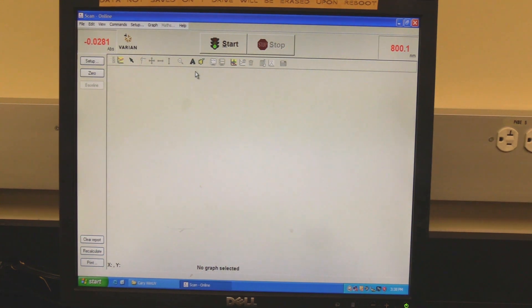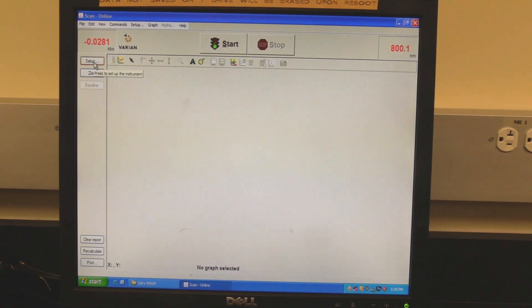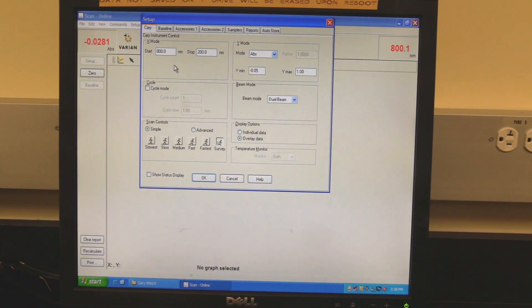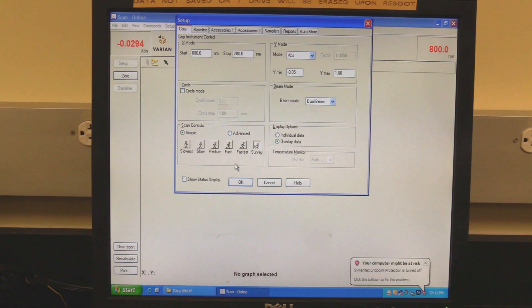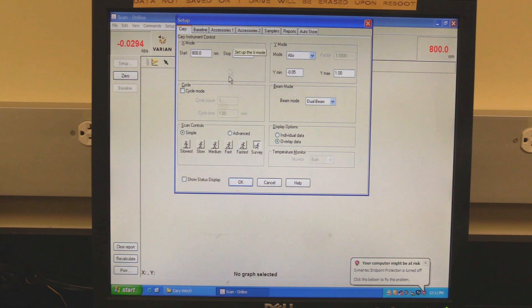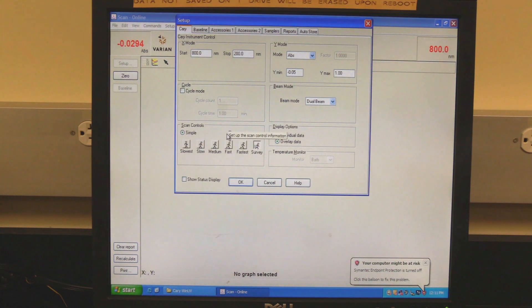Click on Setup to set measurement parameters. Setup should open to the Cary tab. In the X mode section, set the scan range. Start is the higher wavelength and stop is the lower wavelength. Beam mode should be set to dual beam. In scan controls, set the scan speed.